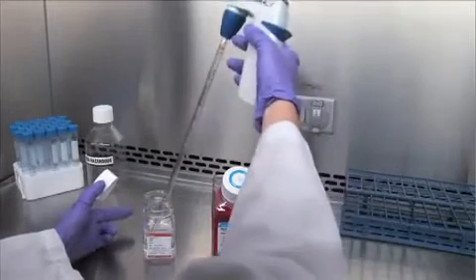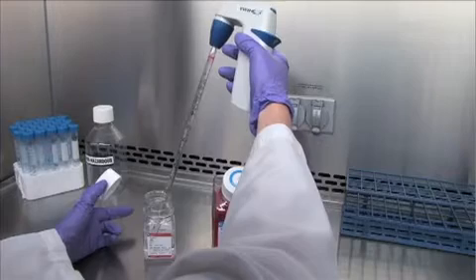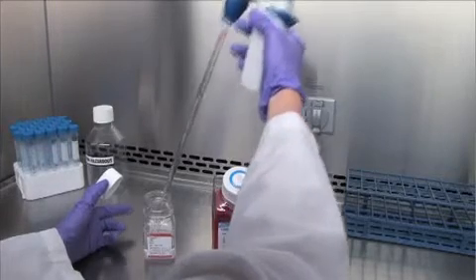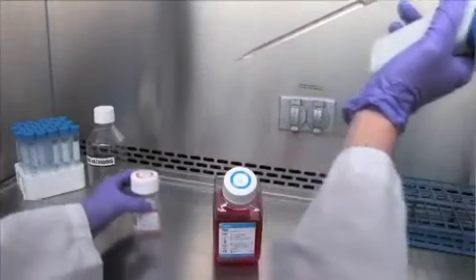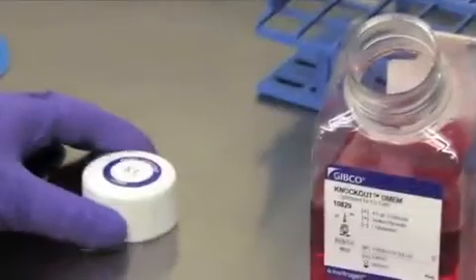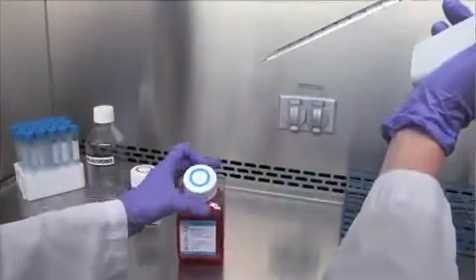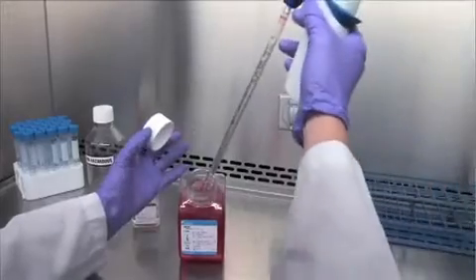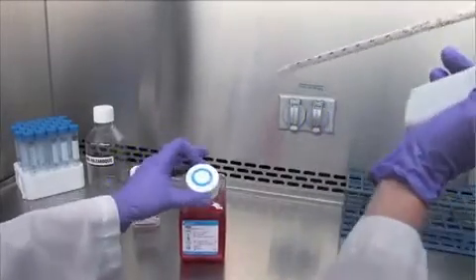Opening these items outside the sterile field will result in contamination. When holding the cap, it is important not to touch the inside edge or you could contaminate it. Replace the cap as soon as possible. If you must set the cap down in order to free your hand, set it down with the interior surface facing down. When pipetting, try not to touch the pipette to anything non-sterile, particularly the outside of containers, or contamination could result.